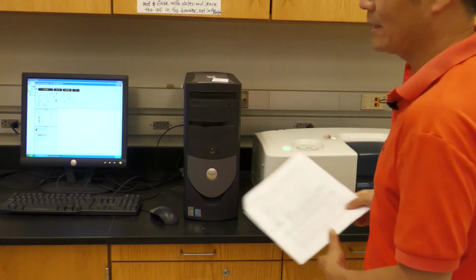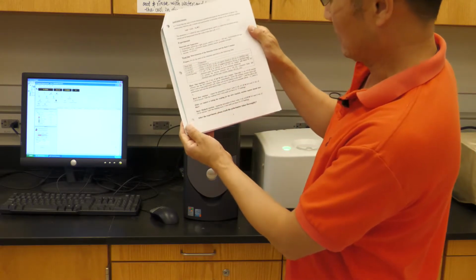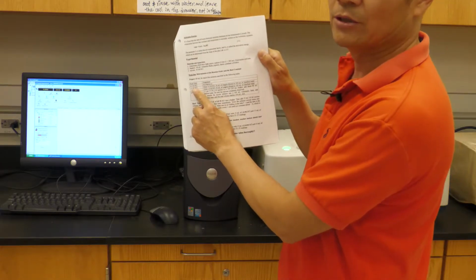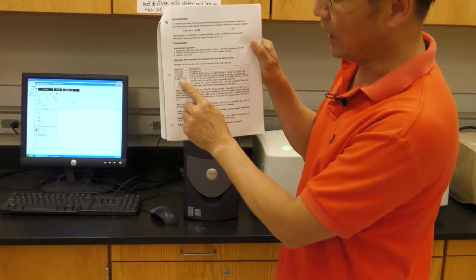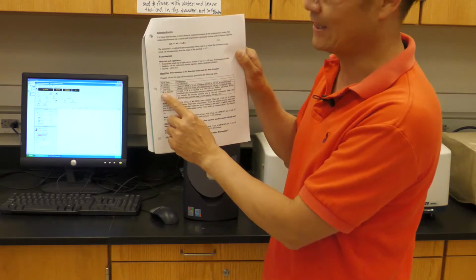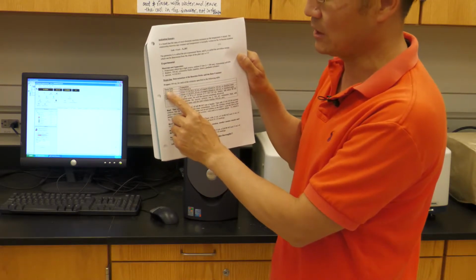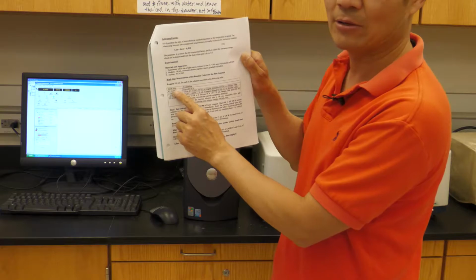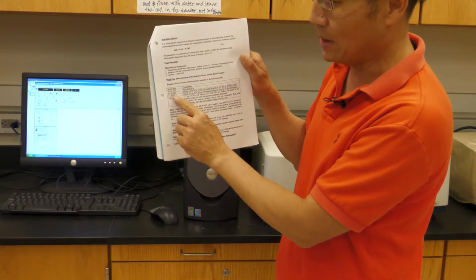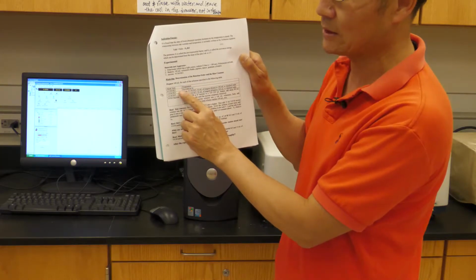Now, before you do any lab, I want to remind you: first, go to your handout, to page 7. It says the solution concentration. Your concentration of HCl here is too low, so we cannot see it clearly during our lab time. So I suggest you change 4 molarity to 8 molarity, 2 molarity to 6 molarity, and 1 molarity to 4 molarity. So change these concentrations to 8, 6, 4.